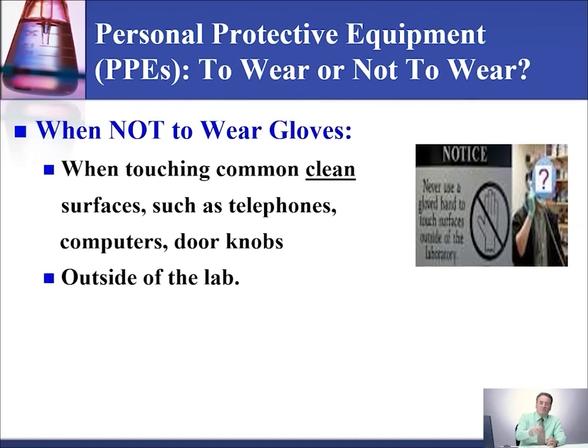You put the items in a container or in a biohazard bag, then take your gloves off, take the items with you, and when you reach the other section, okay, if you are required to take these items out and put them in a rack, for example, or in a refrigerator, then you wear gloves again, and you take them out and put them in a rack or in a refrigerator.